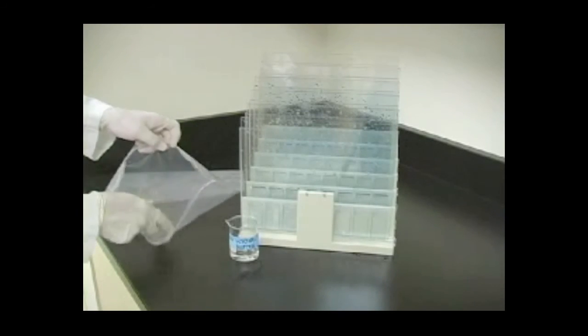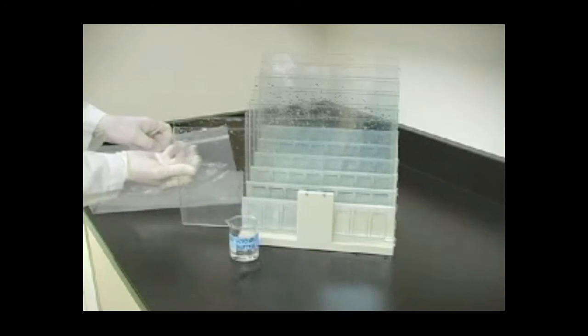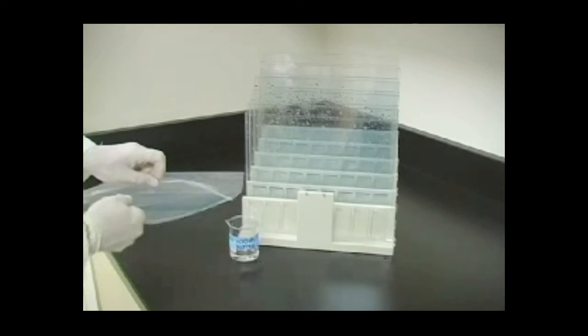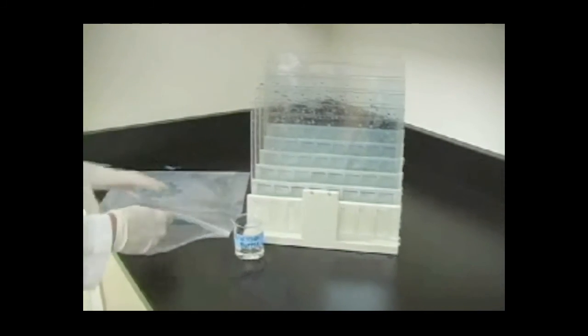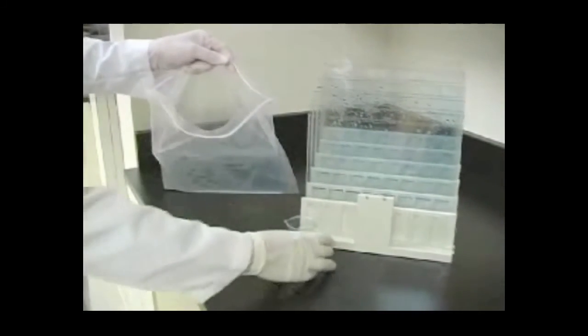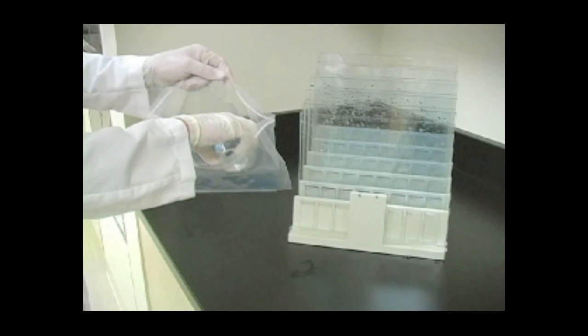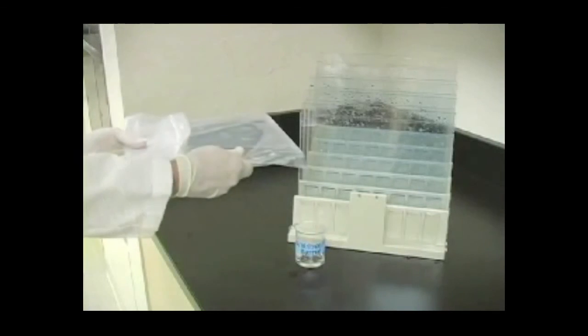The gels are now ready to use. To store, place the gel cassette in a tightly sealed container or Ziploc bag. Add a few milliliters of 1X gel buffer to the bottom of the container and to the tops of the gels to prevent them from drying out. Store tightly sealed at 4 degrees Celsius.